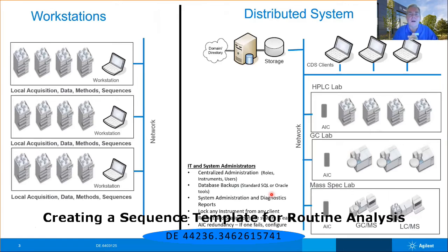I had a very close friend of mine up in the Boston area. They had come in after a weekend off, and one of their workstations was underneath a pipe that burst. The workstation got wet, and it completely died. Well, that workstation was attached to 4 different instruments here. It took them over 2 weeks to be able to get another workstation, get the software loaded and qualified onto that system in order for them to be able to use those 4 HPLCs.